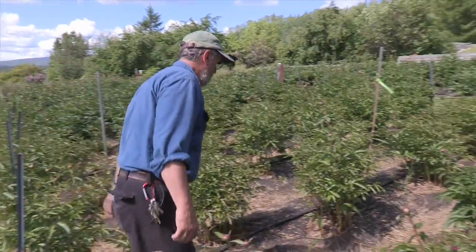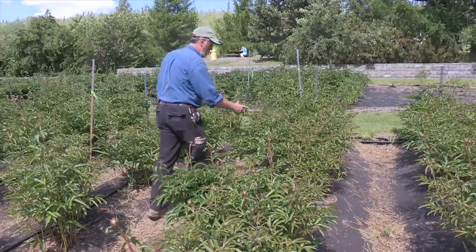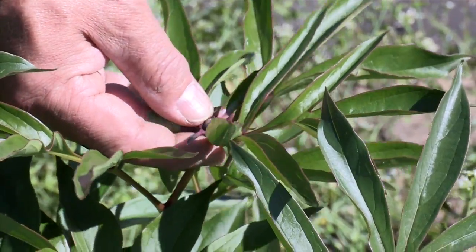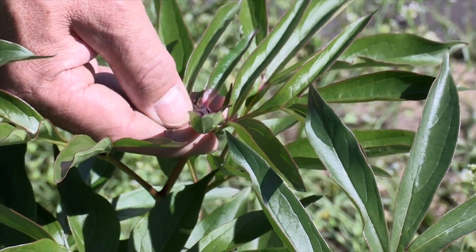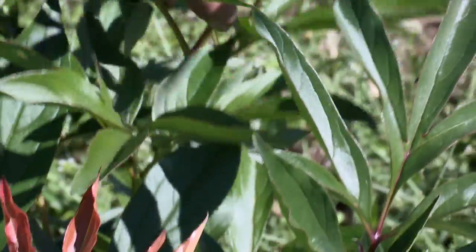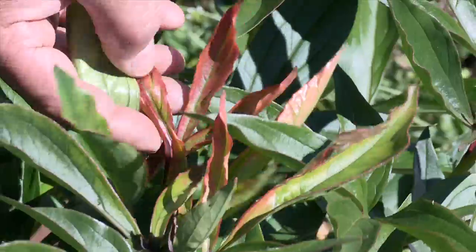In order to correlate the soil samples with the plant tissue samples, we need to establish an acceptable range of soil nutrients by collecting soil samples from plants that look healthy with large dark green leaves and good growth, and collecting samples from plants that don't look as good, with pale yellow leaves or poor growth, to compare against.